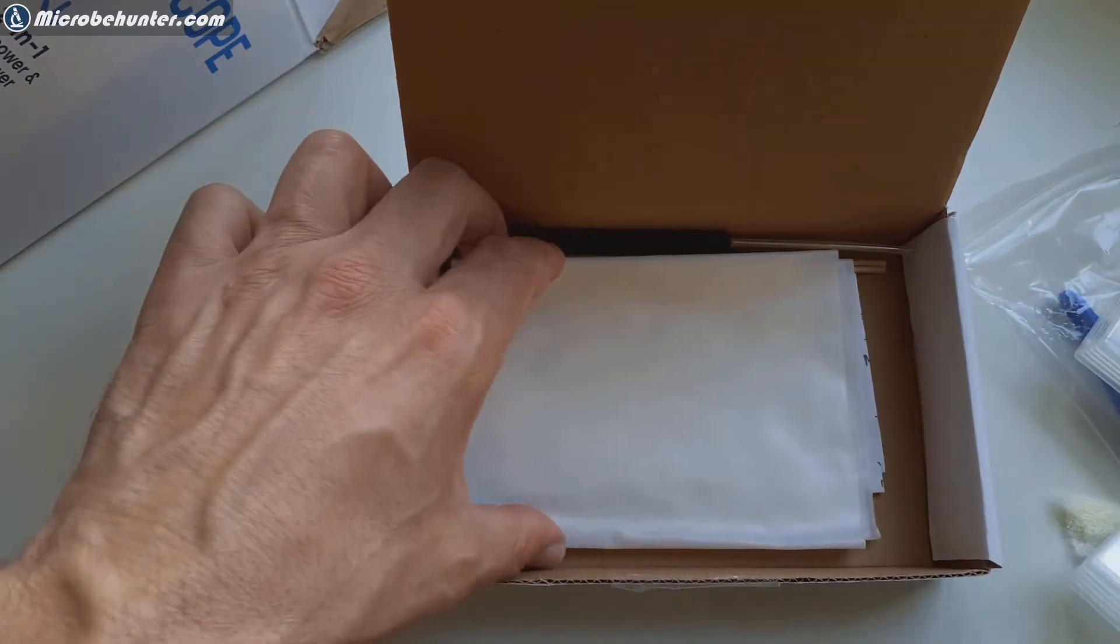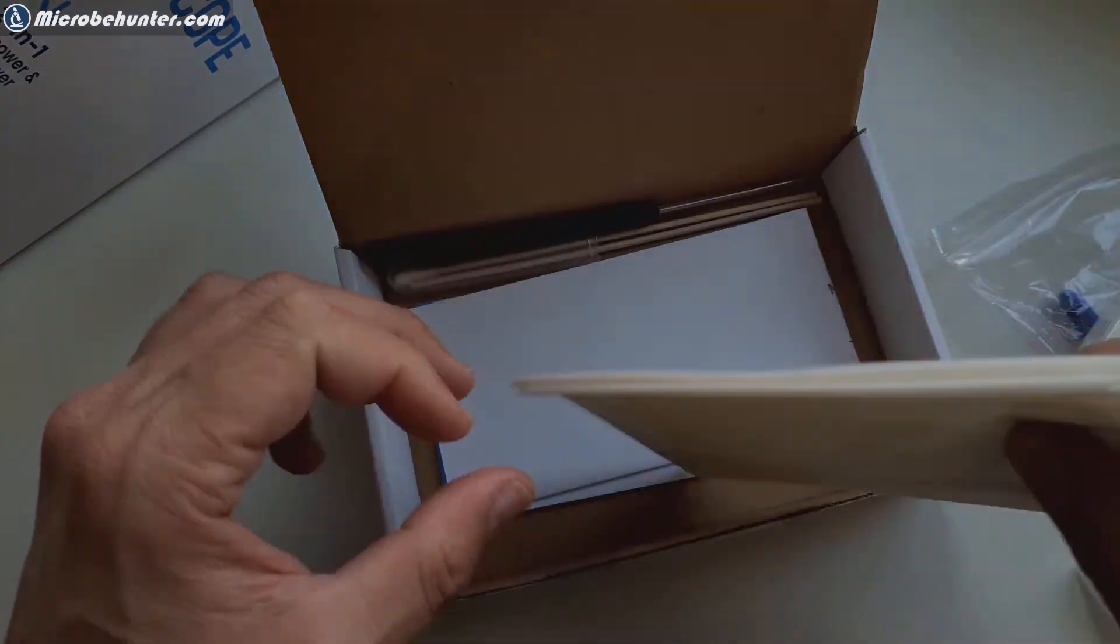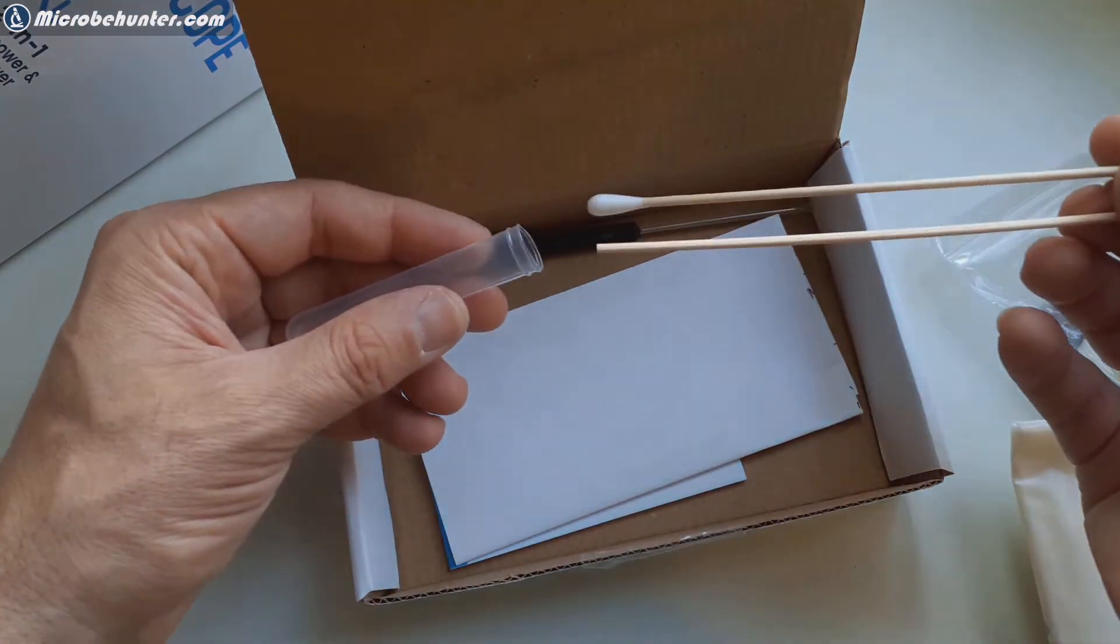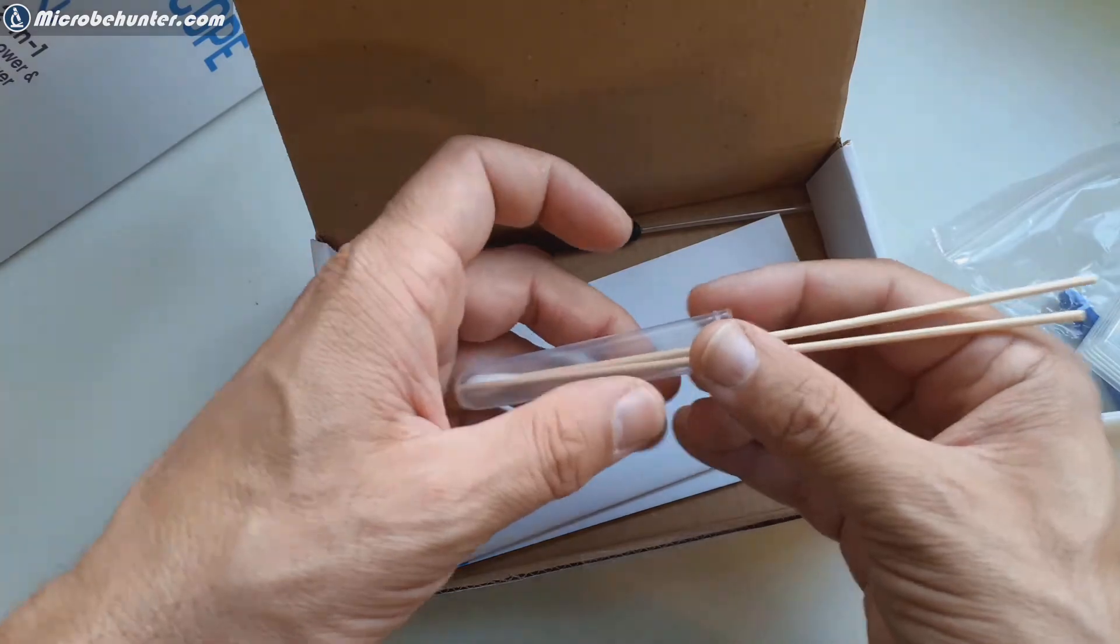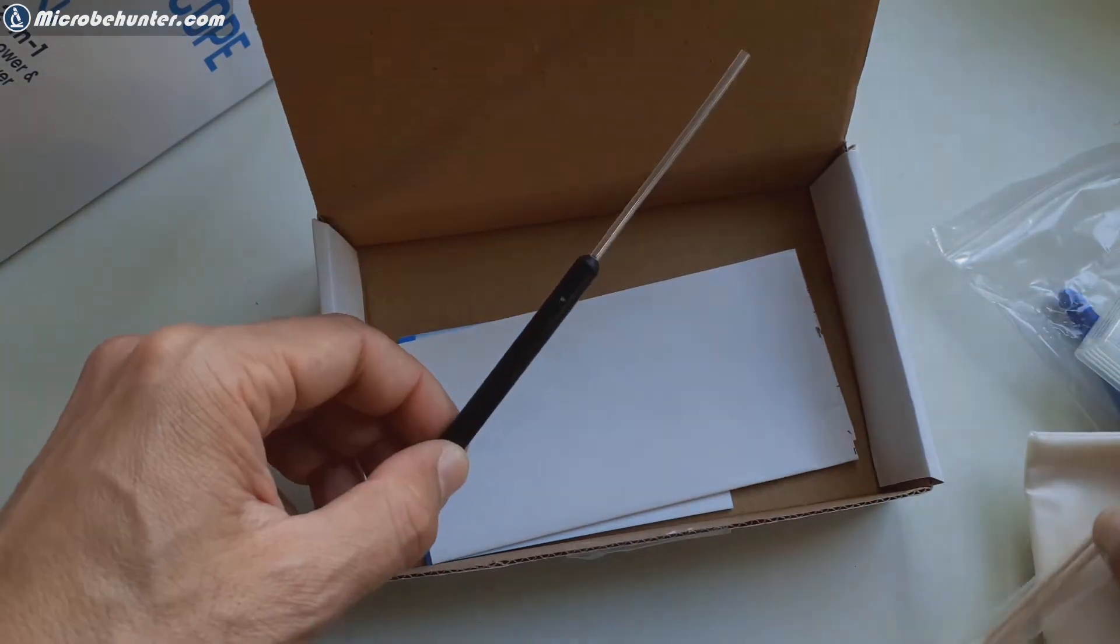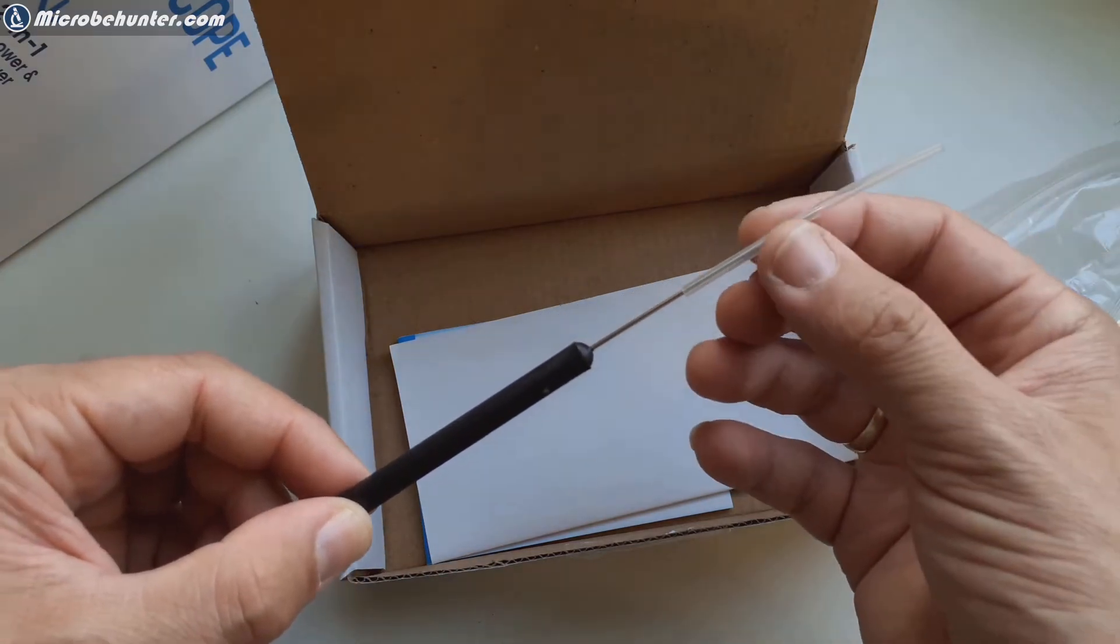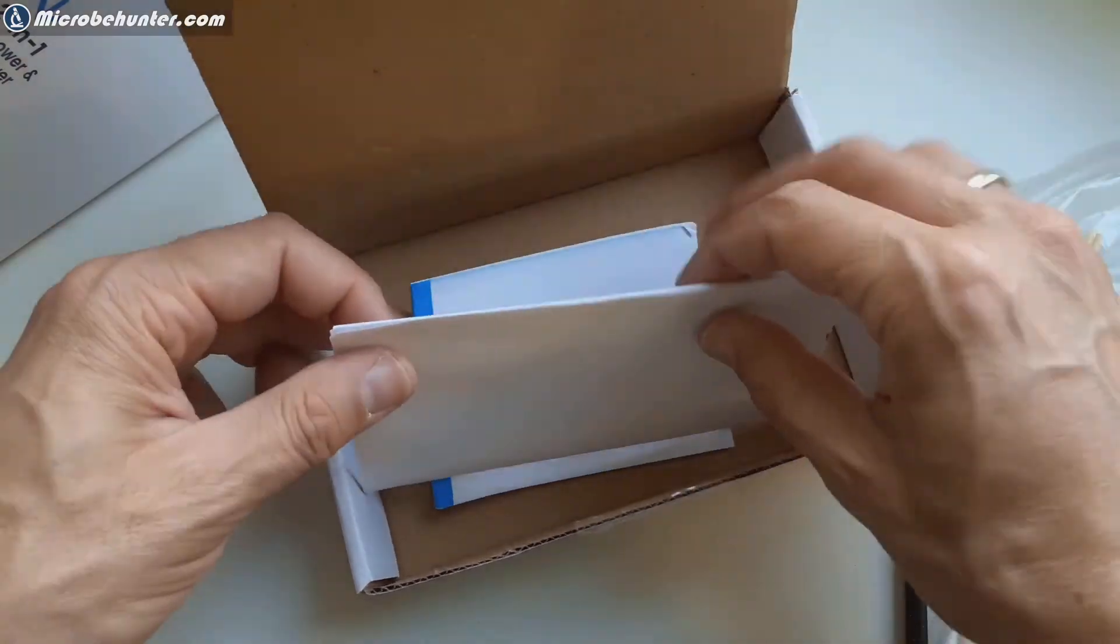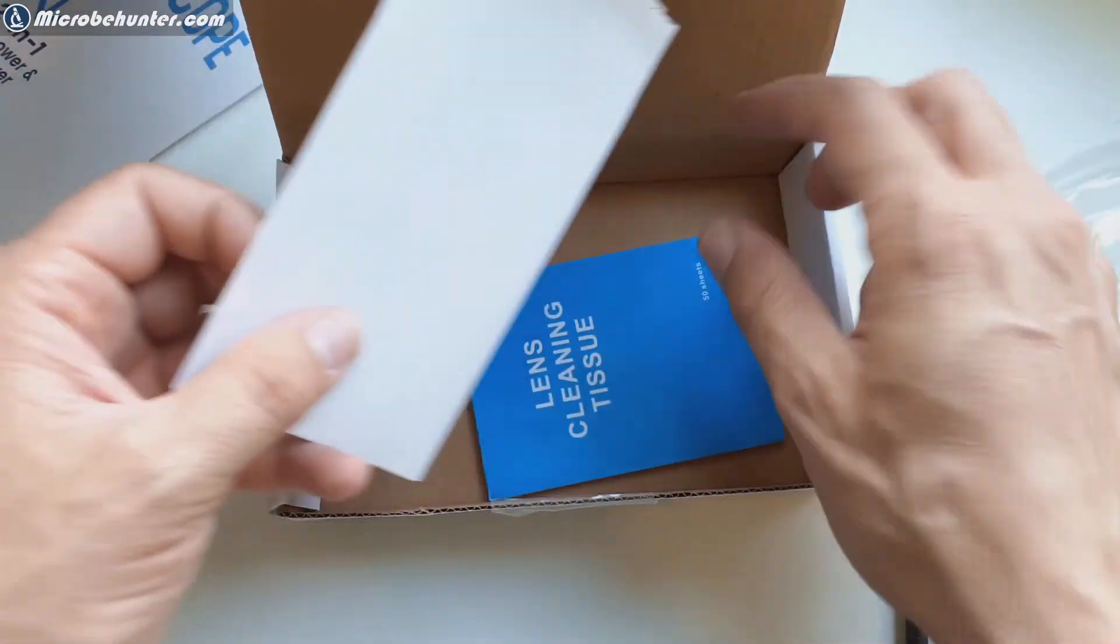So this here is a dust cover to keep the microscope clean and some more tools for example for taking samples from the inside of the cheek using the cotton swab and this is called a teasing needle. There is a protective plastic tube over it otherwise you might hurt yourself because it's quite pointed and sharp and this needle is used to separate for example algae and other difficult to separate specimens.